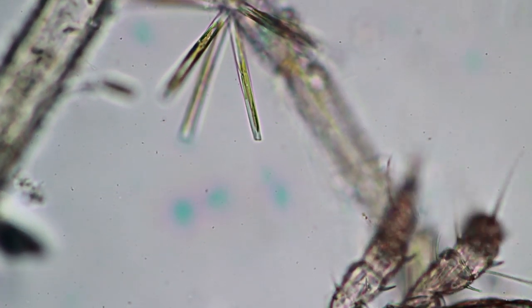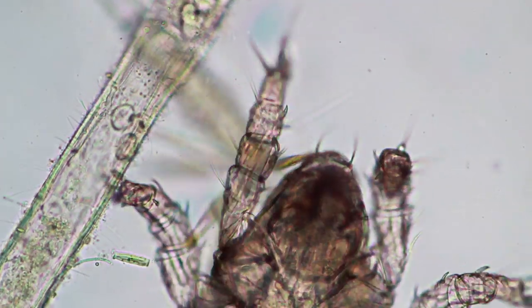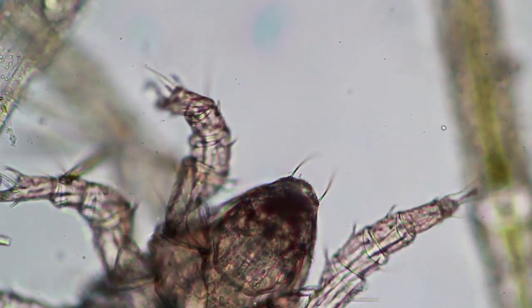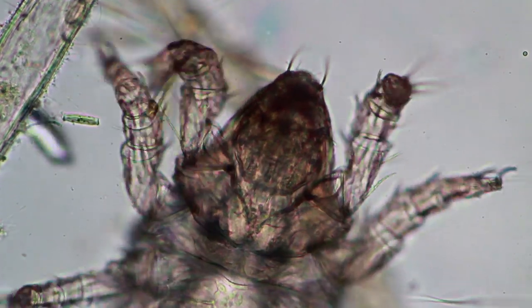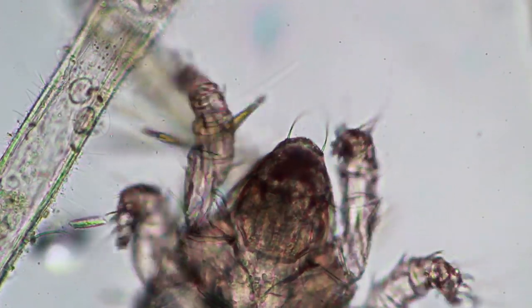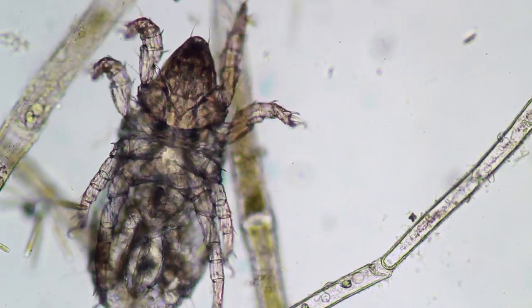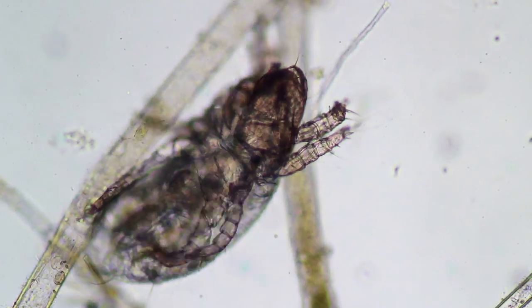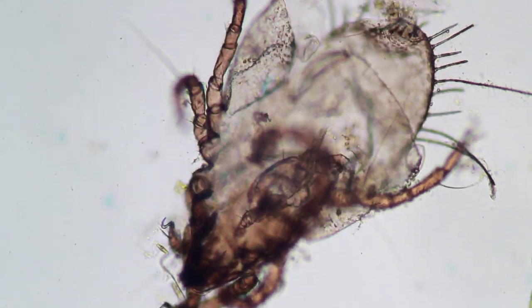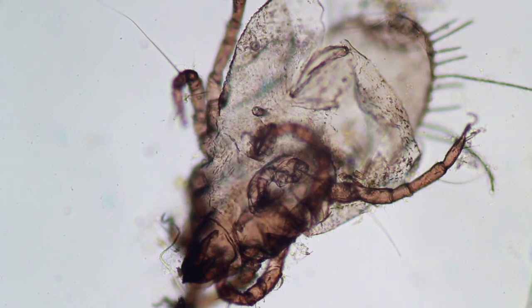It's interesting how they move — quite slowly as a matter of fact — but if they have to cover larger distances, what they generally do is cling on to other animals, insects, large insects, or also mammals. Some mites are also able to make a thread just like a spider, and the wind is able to carry them along, so they rely a little bit on other methods of mobility. Mites are also known to cause some allergies — especially the so-called house dust mites — but those water mites, well, they don't.